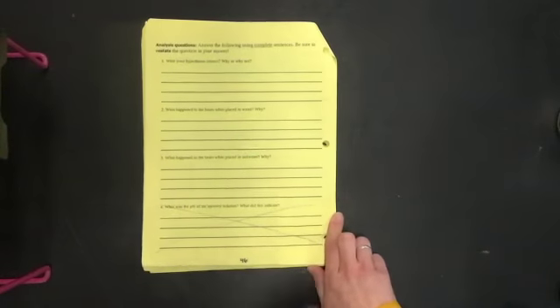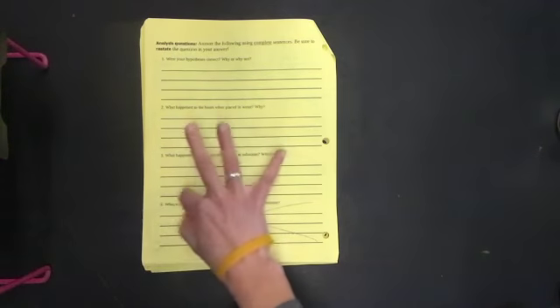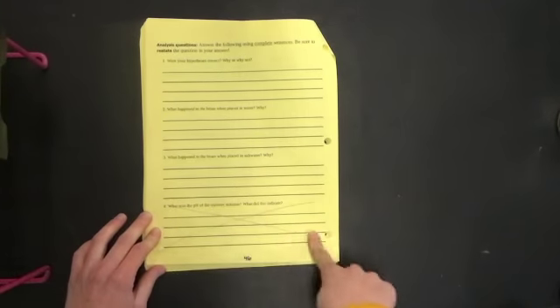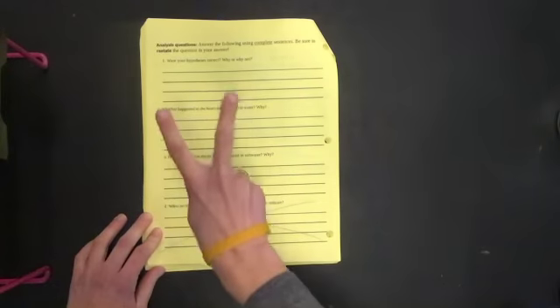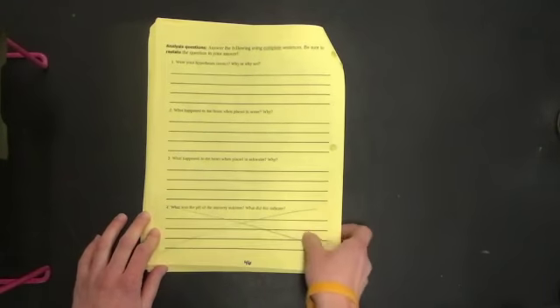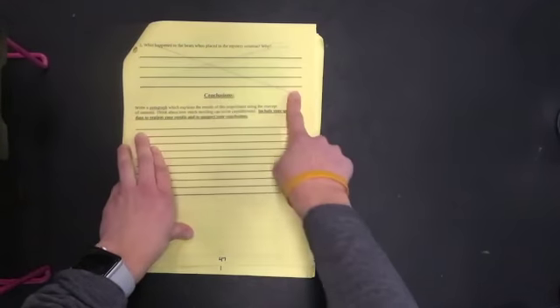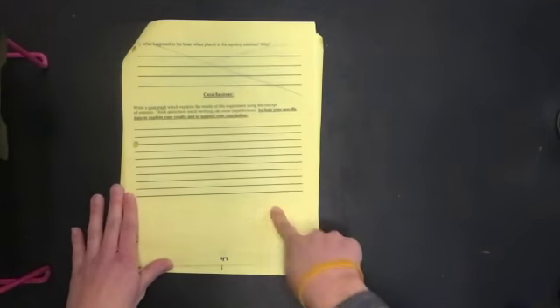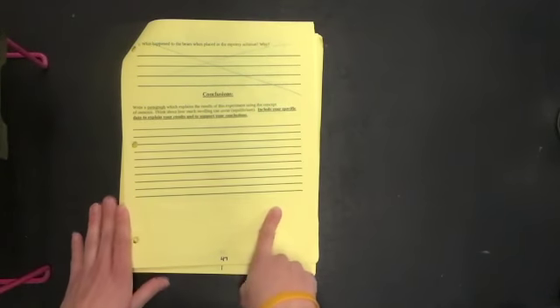Now, because we are only doing 2 gummy bears and not 3, you are going to cross off number 4. You're completing 1, 2, and 3. Leave those as is. Cross off 4. And flip again to page 47, and you're going to cross off number 5. You will complete the conclusion, so don't cross that out and leave as is.